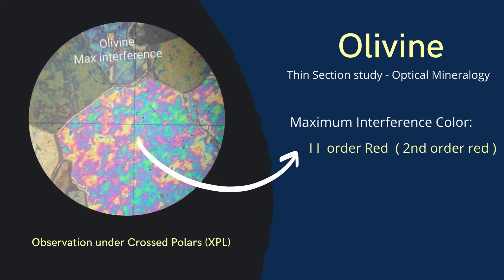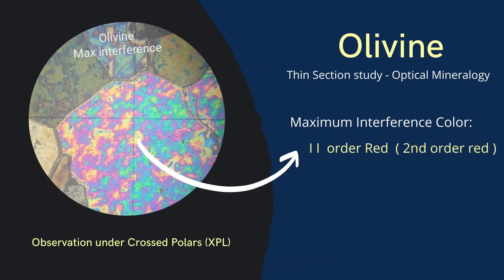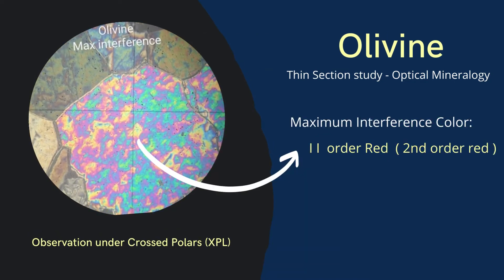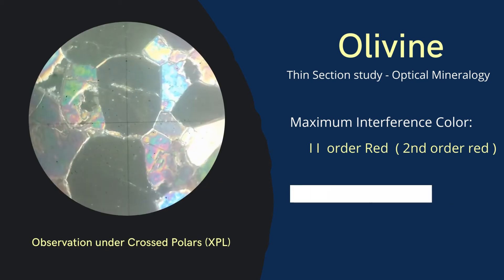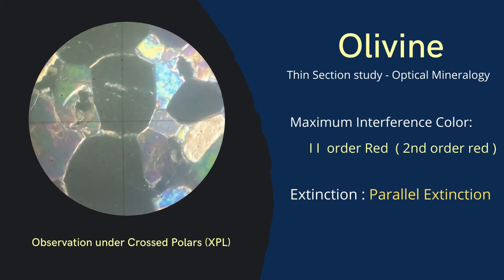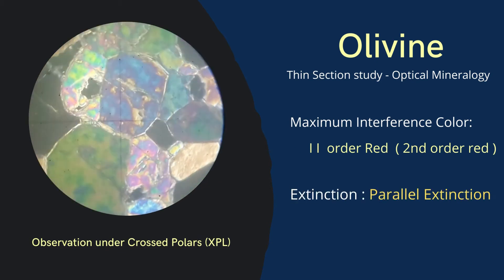Under crossed polars, olivine shows second order maximum interference colors, parallel extinction.